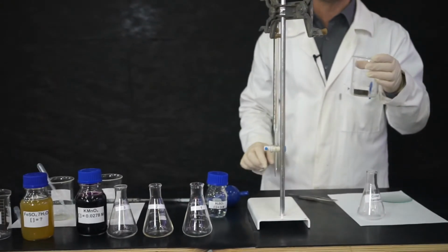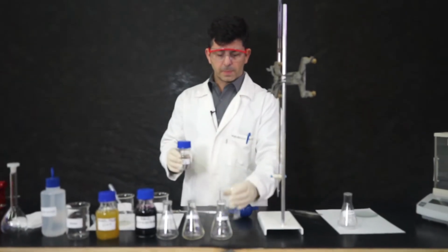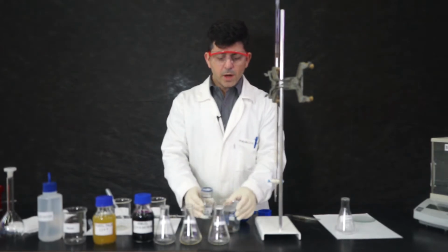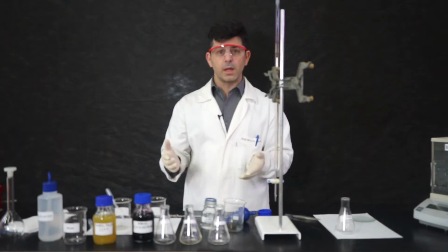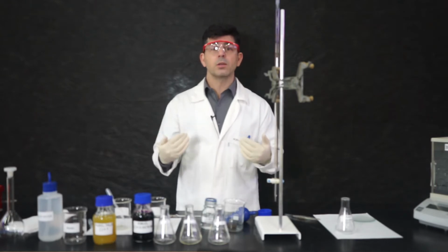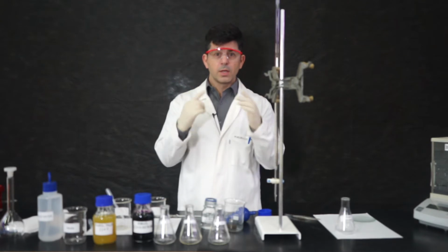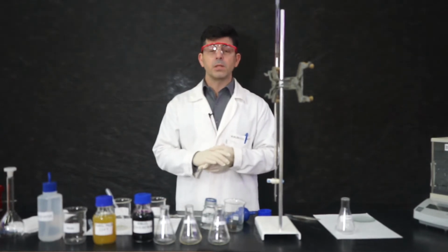All right? Okay, now guys, we will get this piece of ore and we will dissolve it using sulfuric acid, because I need to make sure all this iron is aqueous. Before I do this, well, working with acids is always something dangerous. So whenever you go to a lab, you need to be wearing a lab coat made of cotton, which doesn't catch on fire very easily. You should wear gloves and goggles. Never go to a lab without all the safety materials you need.